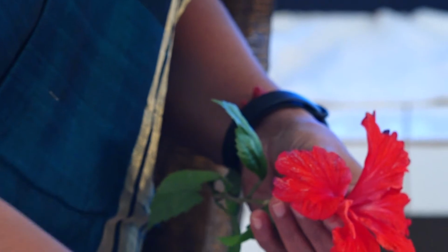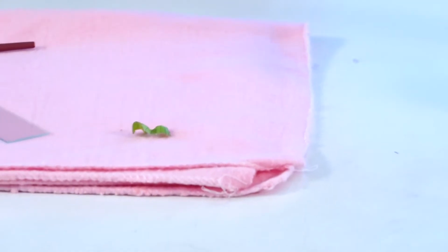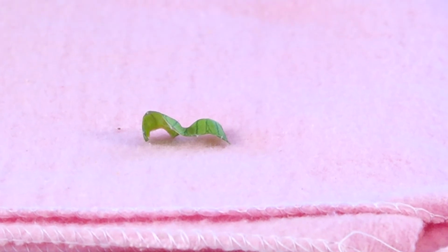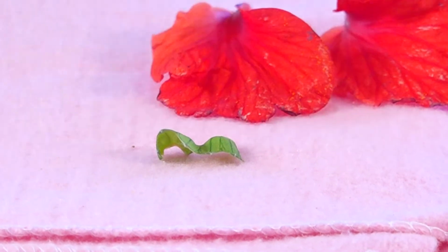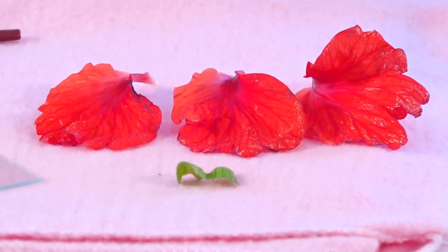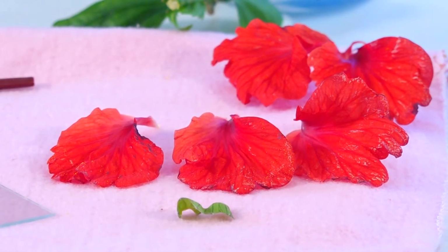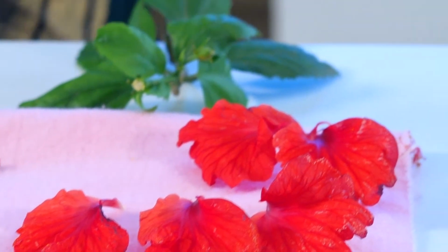So this is the calyx which are fused, the petals are free here. See these are the petals, they are polypetalous. See, just below that we will find all these. The position of the ovary is superior.